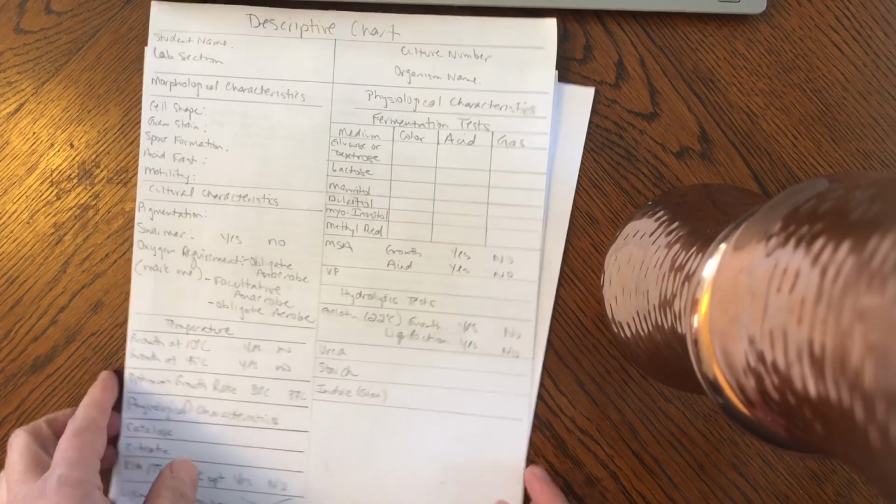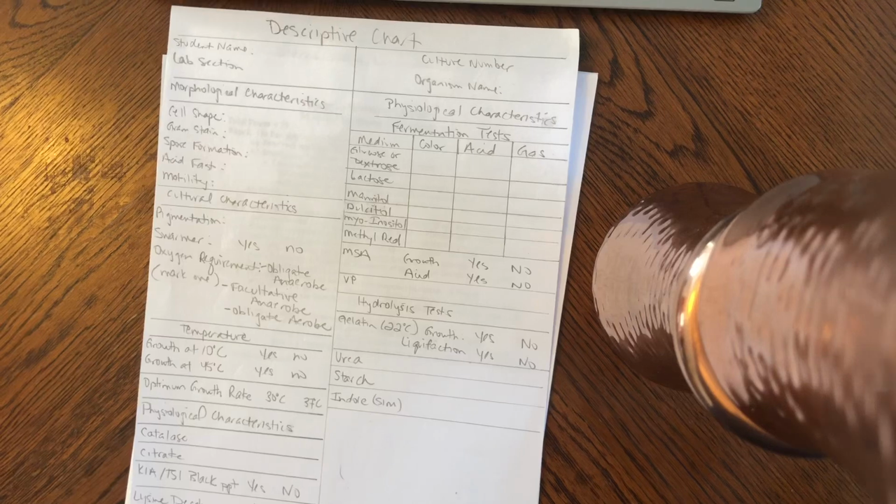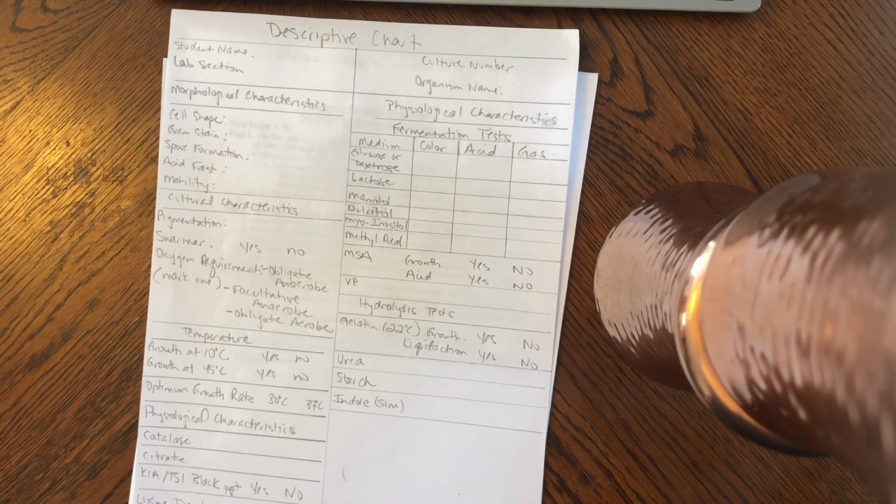We're going to go over how to do your unknown report, but before you do that, we first have to finish filling up the descriptive chart. I don't have one with me, not a blank one anyway, so I just drew one so you can see what all you still have to fill out.